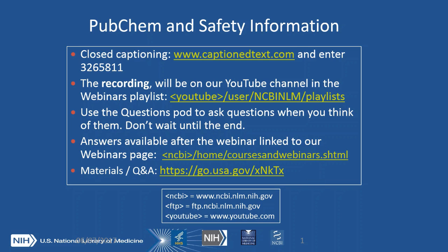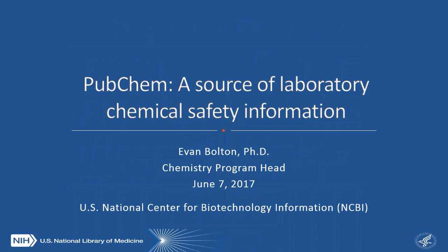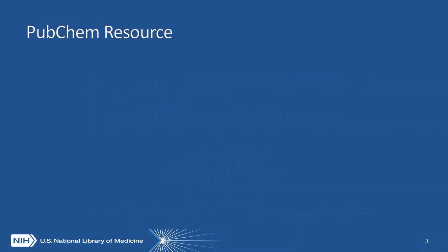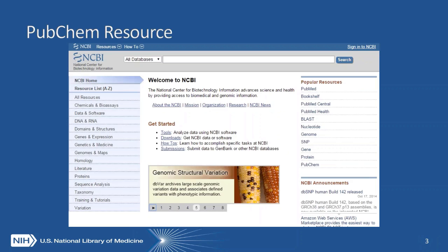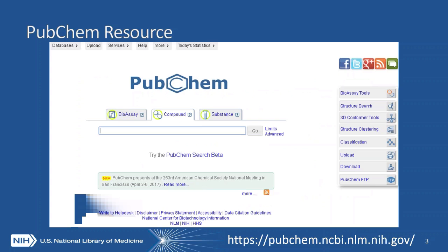I will turn this over to Evan. Hello everybody, it is nice to see we have a nice audience. Today I'm going to talk to you about PubChem as a source of laboratory chemical safety information. If you are not aware of what PubChem is as a resource, I'll give you a quick overview. We're centered here at the National Center for Biotechnology Information, and we contain the chemical content found within NCBI within the resource called PubChem. This is our home page — I encourage you to explore it, especially the Services tab at the top, so you can have greater familiarity with the resource.